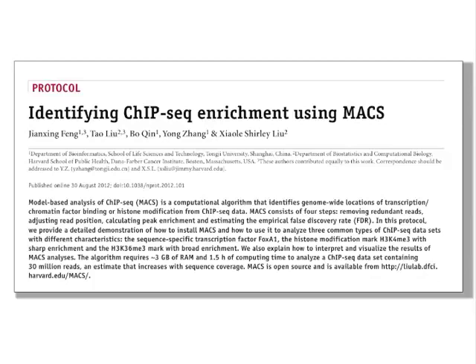So if you want to read up a little bit more about how MACS works, and once again, I got a lot of figures for this portion of the talk from this paper, I suggest going and looking at their most recent paper, which is Identifying ChIP-seq enrichment using MACS.